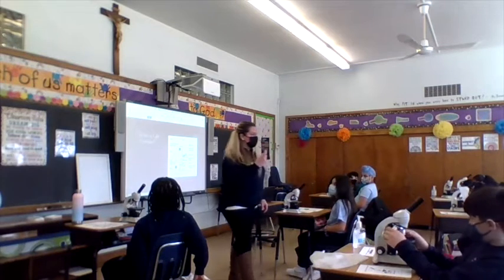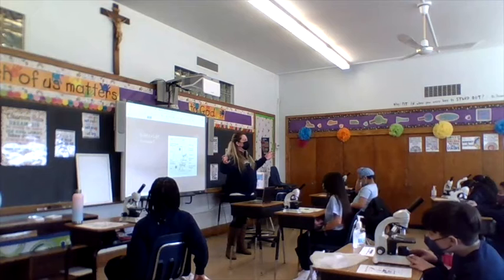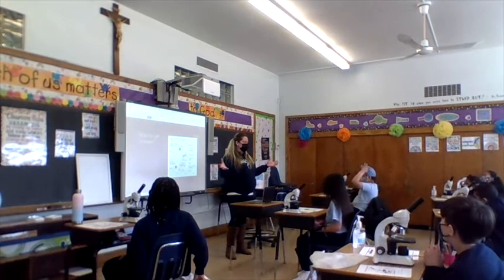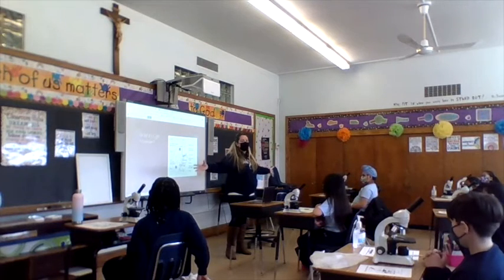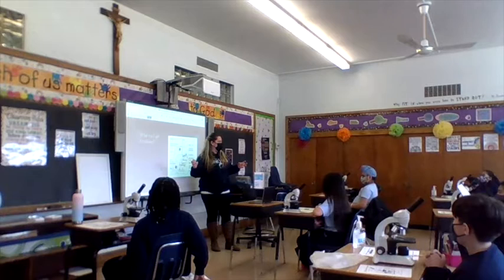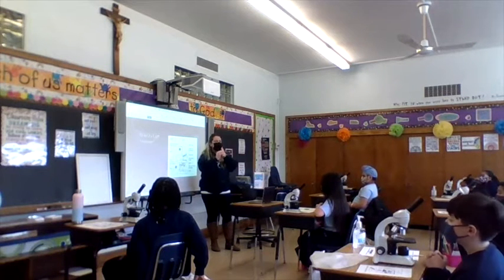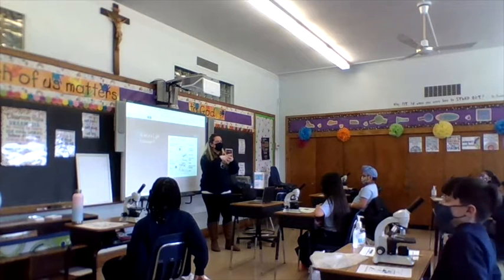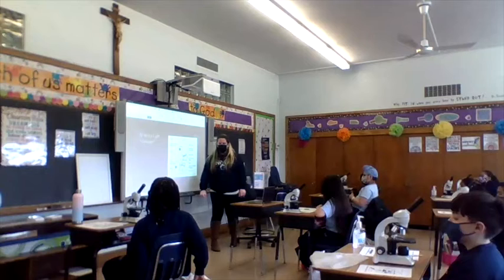So there's 40 times, and then you have smaller lenses. The other two are smaller. The 40 times we learned in math, right? You times it by a power of 10, it's going to be bigger. So it's going to get magnified. Say magnified. So when you're looking at a tiny, tiny cell that we can't see, the lenses help you see it because it gets magnified. Make sense? Yes, it does.